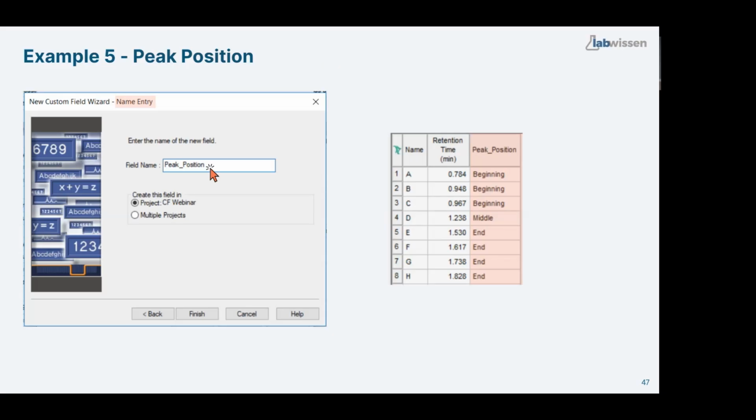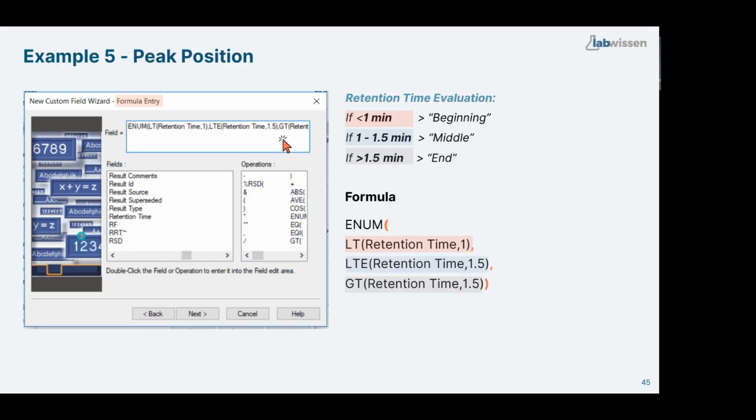Follow-up to the first question I asked: I want my scientists to enter the column information into the sample set prior to starting an analysis. If not entered, then a window will pop up stating this information must be entered to start your run. Can you show that? I cannot show it now in Empower, but to do this, that is the sample set custom field, and you need to check.